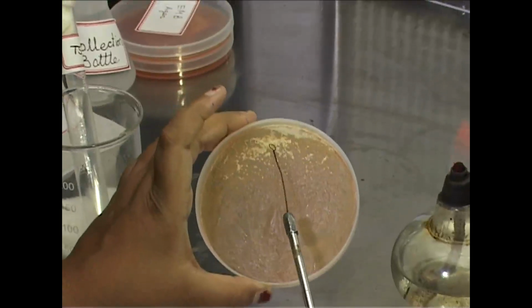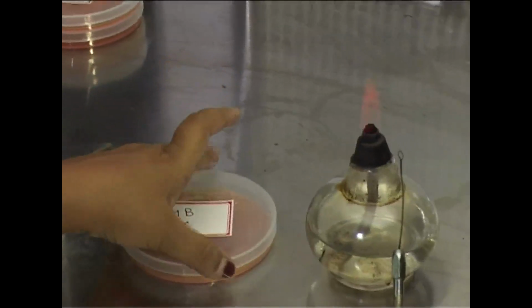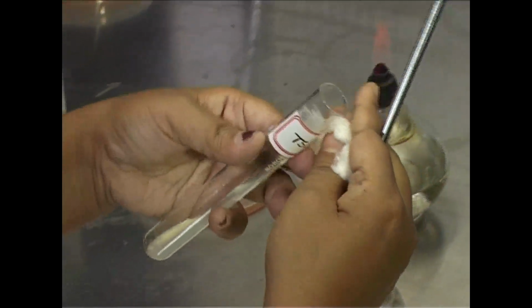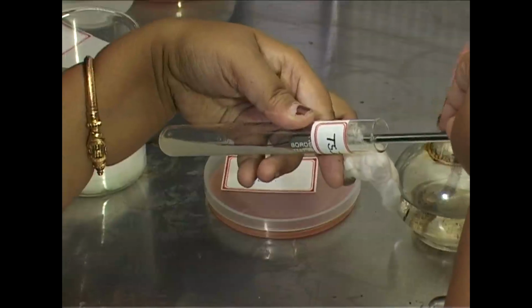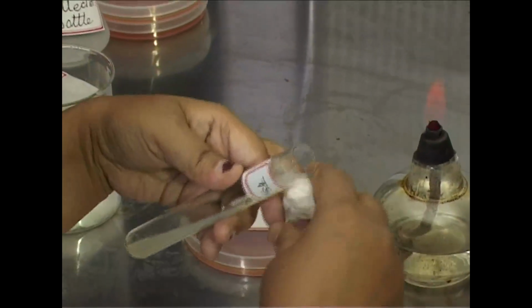Streaking over TSI agar, triple sugar iron agar, will help to ensure whether the organism is able to produce H2S or not. That can be observed by the small black precipitation.